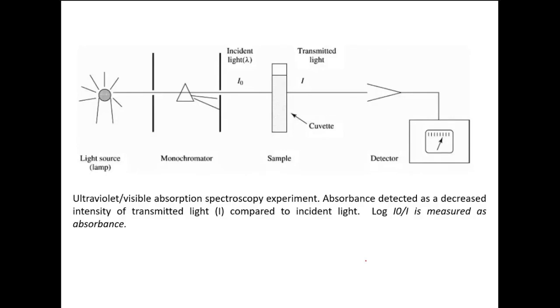You have to use only the term optical density, because what you are measuring at different time points is only the density of the sample, which indicates the bacterial growth. So when constructing a bacterial growth curve using UV visible spectroscopy, you must use only the term optical density.